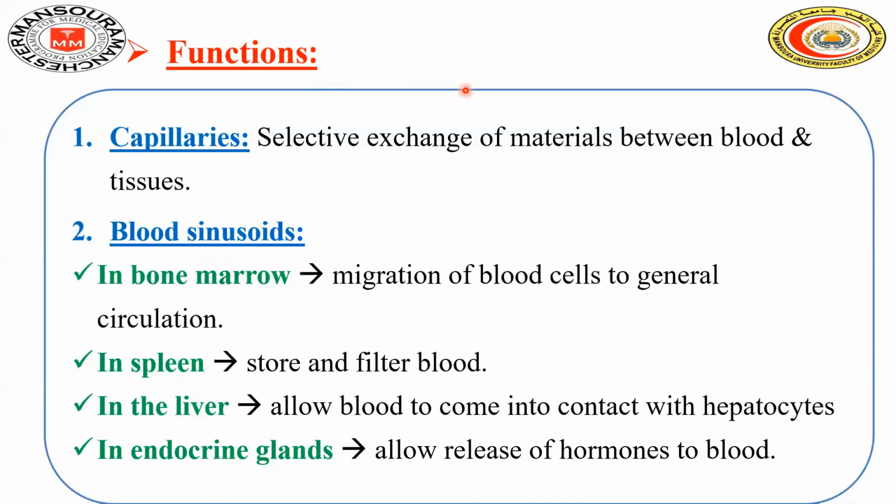We generalize the function of capillaries in the exchange function. But for the blood sinusoids, we mention specifically the function of the sinusoid in each site.